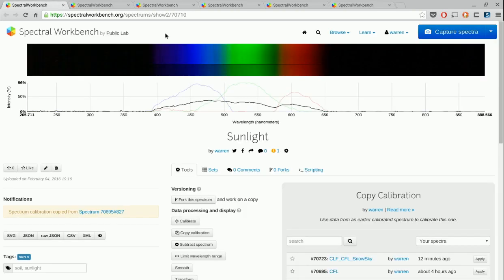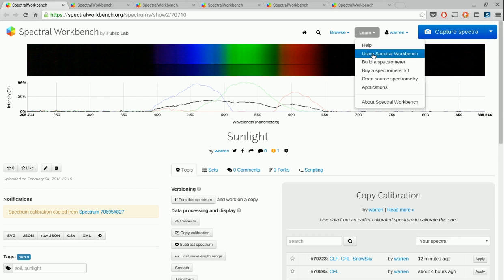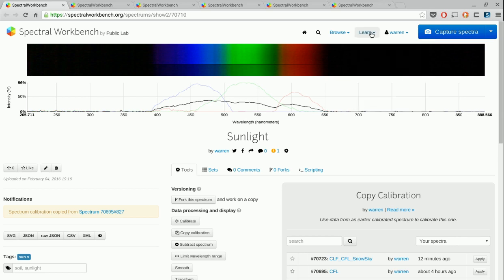That's it for calibration. We'll be going over lots of other techniques and so forth in other videos. So please check it out, under learn. Thanks very much and enjoy Spectral Workbench.